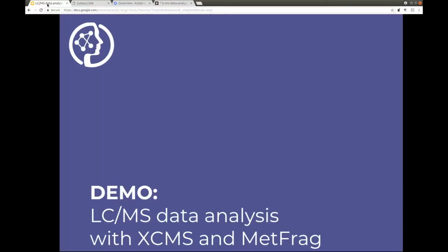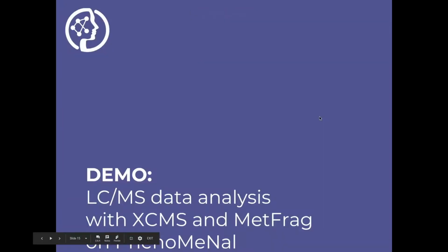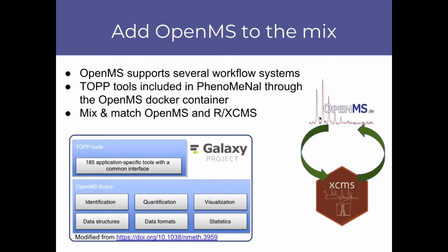Okay, so coming back to the presentation, this was the example workflow we have for XCMS, CAMERA, and MetFrag. But there is more. There are, for example, other tools and tool collections out there. A prominent one is OpenMS, which has been created by a larger consortium headed by Oliver Kohlbacher in Tübingen in Germany.